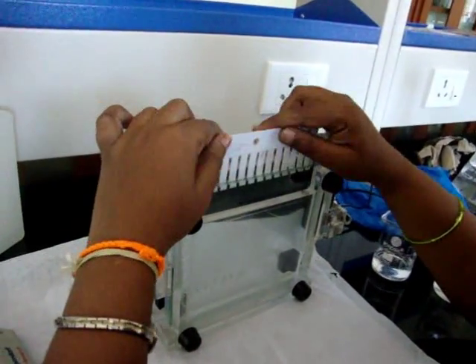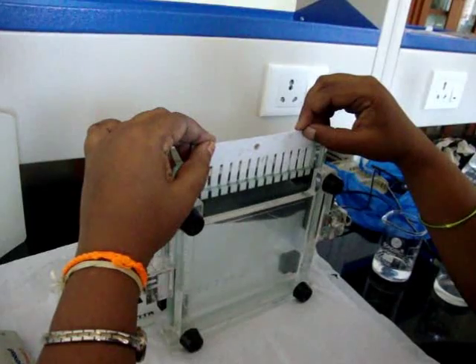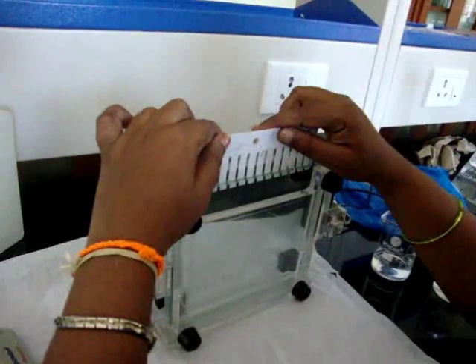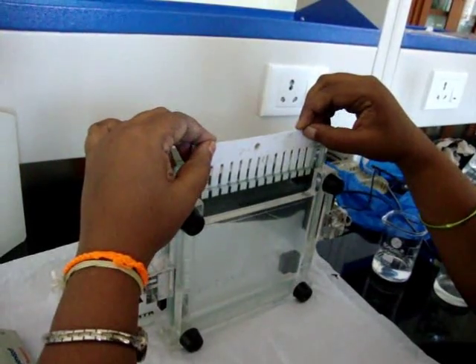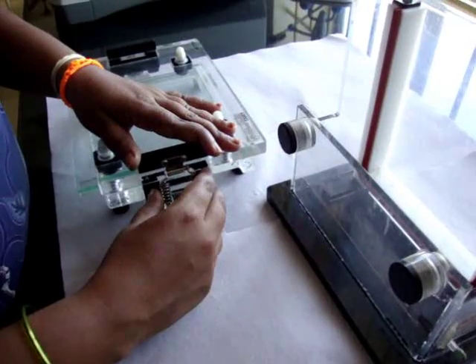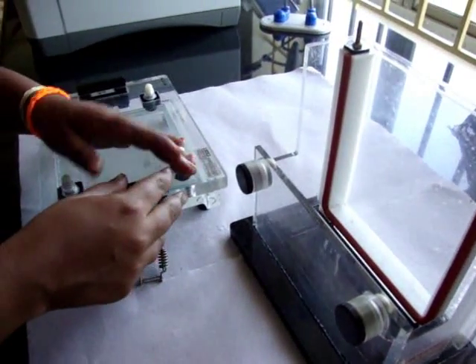Comb is inserted immediately with care so that no air bubble is trapped. It is allowed to polymerize for 15 to 30 minutes. Remove the comb and clamps after polymerization of the stacking gel.